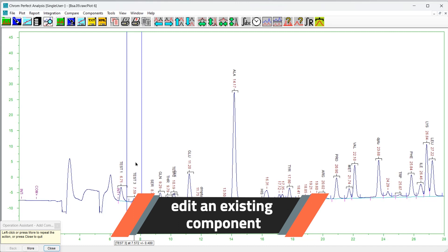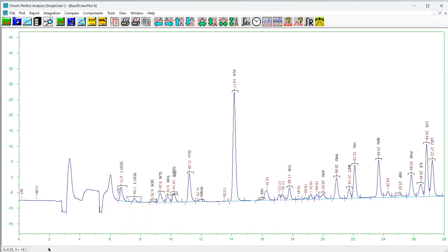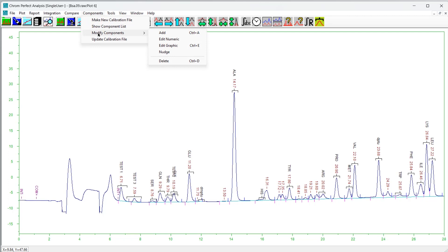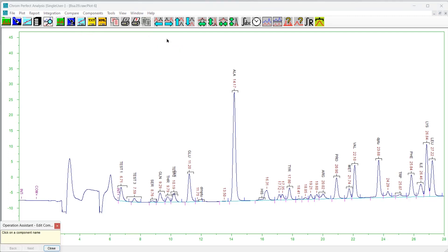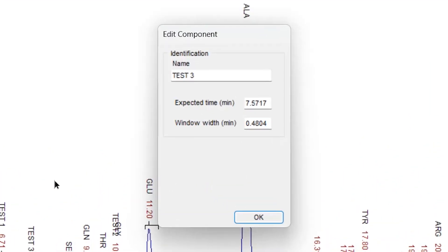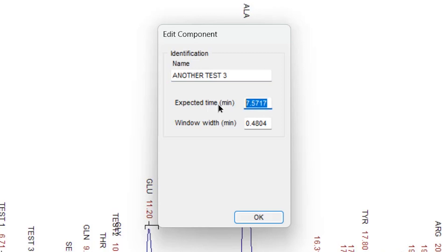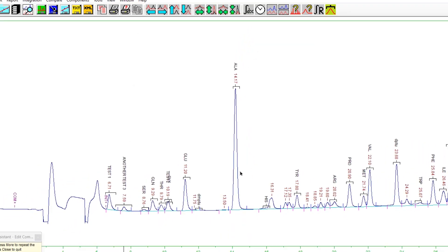There are two ways to edit an existing component: one invokes the dialog just described and the other invokes the click-and-drag method. To invoke the dialog, choose Components, then Modify Components, then Edit Numeric. The operation assistant form will appear. Click on the chromatogram plot and the nearest component will be selected. The nearest event may lie outside the plotted region but it will be found anyway. To confirm the selection, either press the Next button on the operation assistant or right-click on the chromatogram plot. The form will appear; edit the component name, the expected time, or the window width as desired. When finished, press OK.